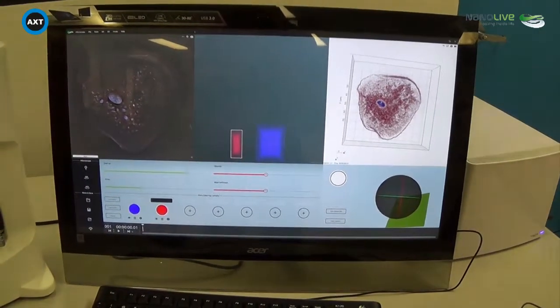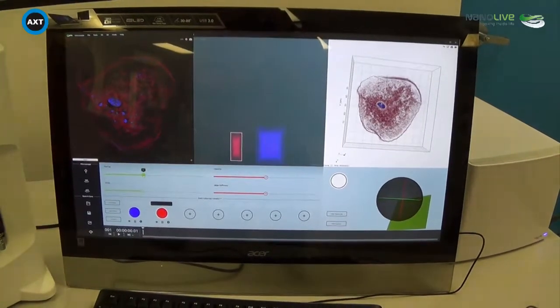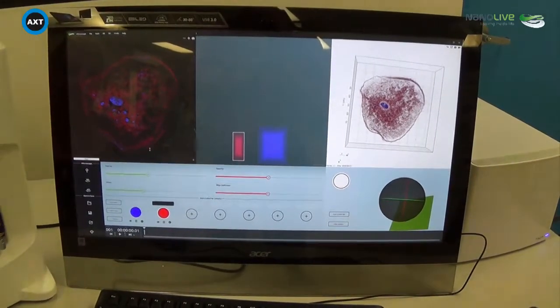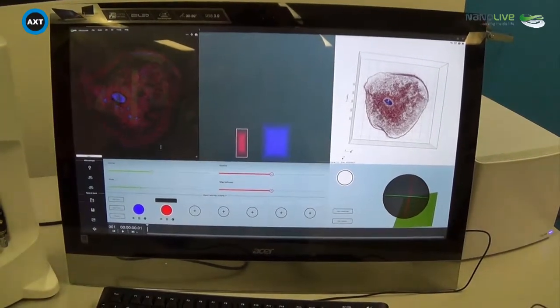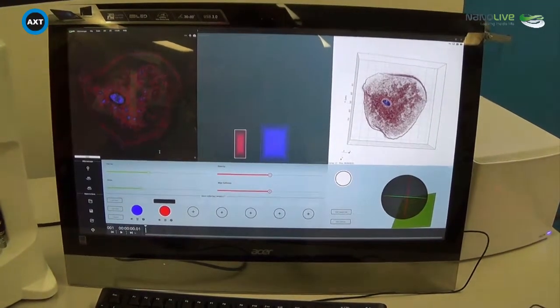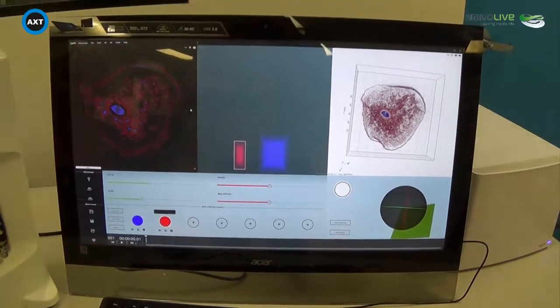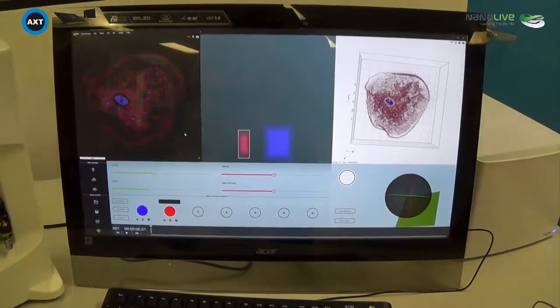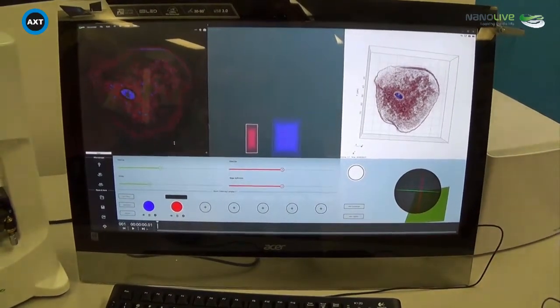If we look back at our 2D image of the cell, we can actually remove the actual cell layer and come back to our more fluorescence looking image and be able to go through those slices that way as well. So here we've got around 100 slices that are within 30 microns. So our sample size is 30 microns in this case, 30 microns thick, and we have 100 slices in the Z direction of that cell.